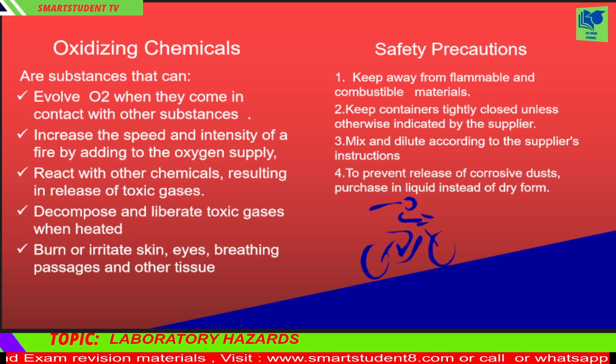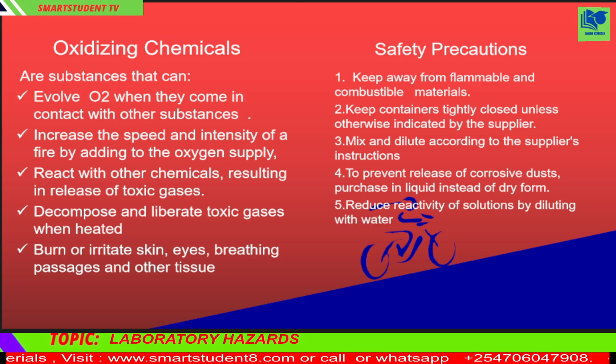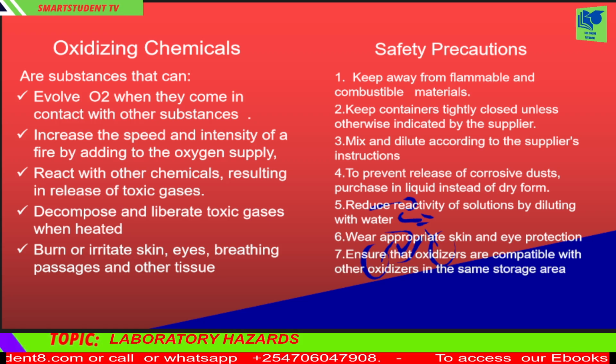4. To prevent release of corrosive dusts, purchase in liquid instead of dry form. 5. Reduce reactivity of solutions by diluting with water. 6. Wear appropriate skin and eye protection. 7. Ensure that oxidizers are compatible with other oxidizers in the same storage area.